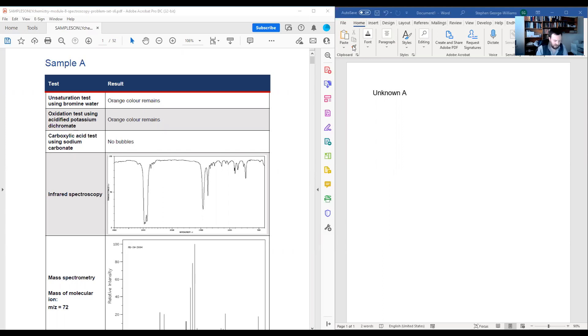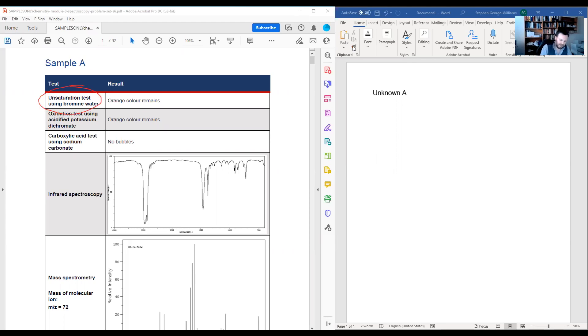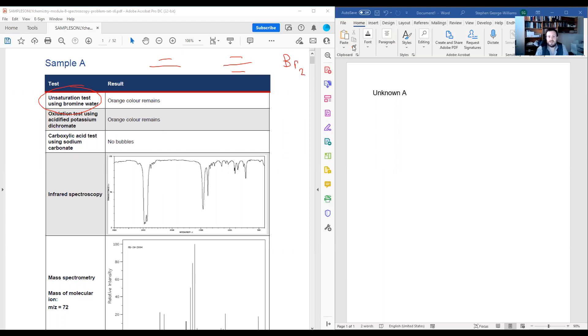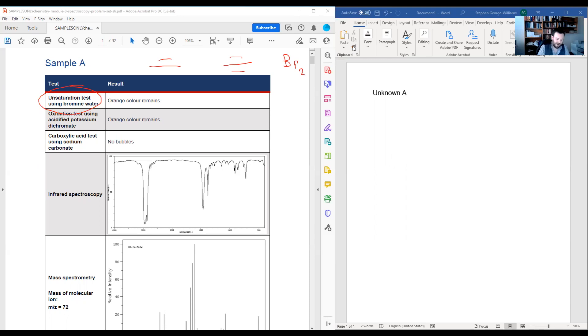Starting off with my first test, I have this unsaturation test with bromine water, which is allowing me to test for the presence of alkenes or alkynes, as these will happily react with bromine, which is a light orange-yellow color in solution. If the color stays, that would mean that there is no alkene or alkyne present. So these functional groups are unlikely to be here.